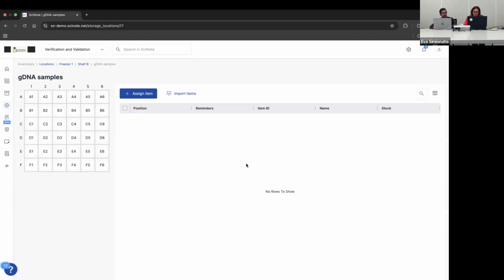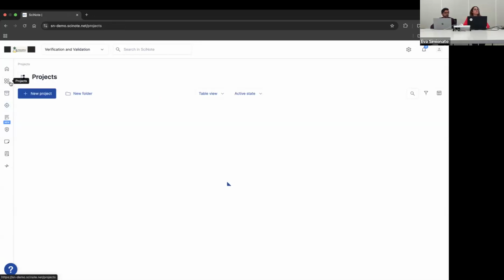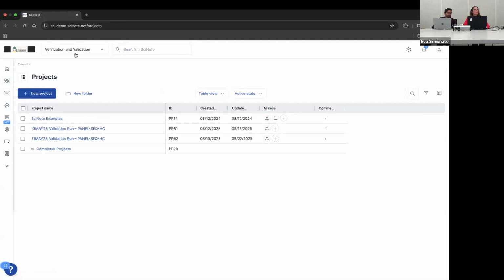All right, we don't have any other question for today. And we are getting close to the time. Maybe I'll mention just one last thing that I've seen actually with a recent customer of mine. What they're doing is they're tracking the calibration information for their instruments in SciNote, but they're actually also tracking the calibration procedures in SciNote. So they're using the project experiment task structure here. They actually went a step further and created a new team for instrument management. And in there, they created a project and for experiment task for each instrument. And they're putting in the calibration protocols.